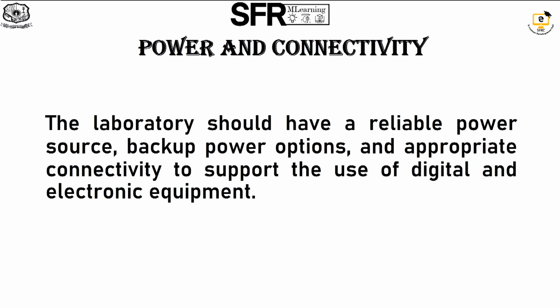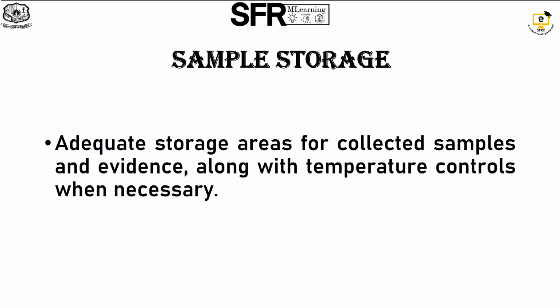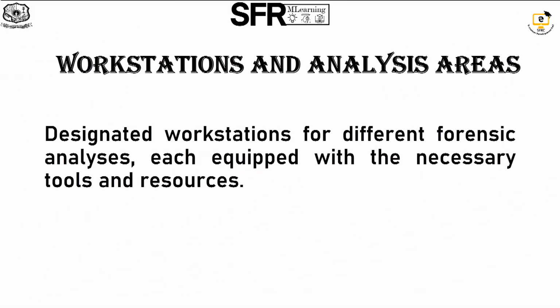Power and connectivity: the mobile forensic laboratory should have a continuous supply of current and internet connectivity in order to give appropriate support to the use of data and electronic equipment. Sample storage: the laboratory should contain adequate storage area for the collected samples and evidence, with proper pH and temperature. Workstation and analysis area: the mobile forensic laboratory should be designed with workstations for different forensic analyses, each equipped with the necessary tools and equipment needed for the analysis.